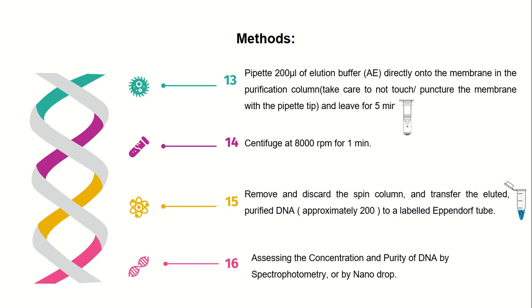We can assess the concentration and purity of the DNA by using a spectrophotometer or NanoDrop.